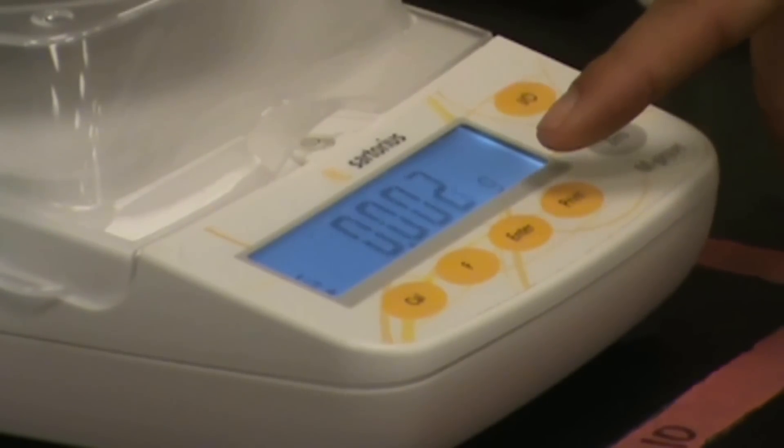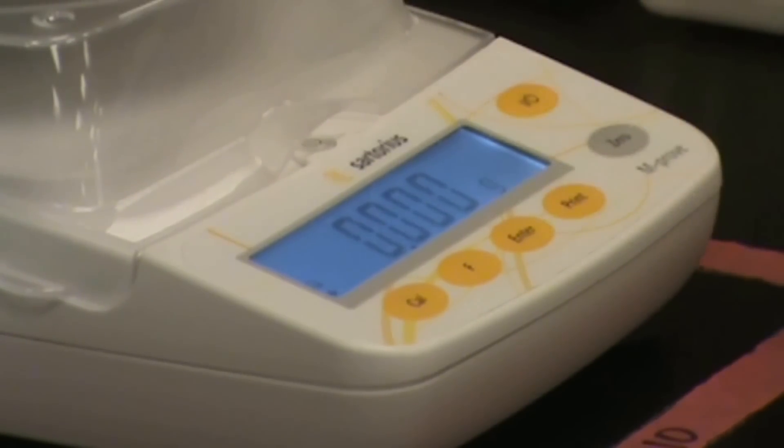One thing you might notice is the last digit or two of mass drifts a little bit due to drafts in the room and vibrations and such. This is perfectly normal. It's not a cause for concern. It's important to remember that grams are very tiny units of mass. So if it drifts by a few hundredths or a few thousandths of a gram, it's not going to cause a significant amount of error.